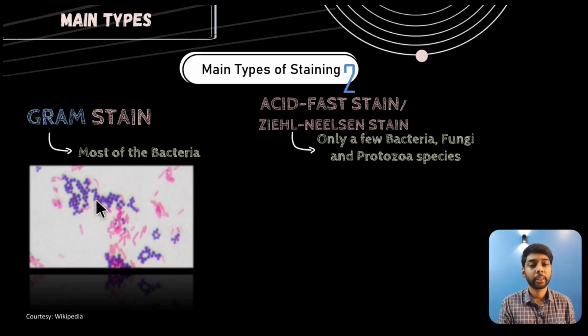If we look at this picture, well, it's an interesting picture because we don't see only gram positive or gram negative. Actually, we see both gram positive purple colored cocci and also gram negative red colored bacilli. So it's a mixed culture slide. It's not a pure culture.